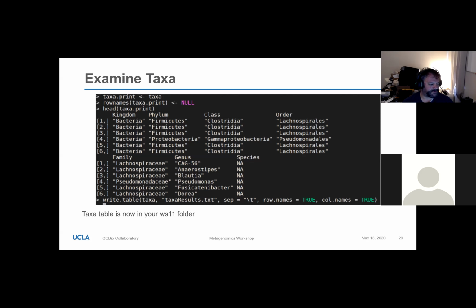All right, if there are no further questions... anybody with questions? Last chance. How long should this taxa step, or assigning the taxa, take, just out of curiosity? Assigning taxa can take a few minutes. So if it takes like 5 minutes, it's not completely surprising.